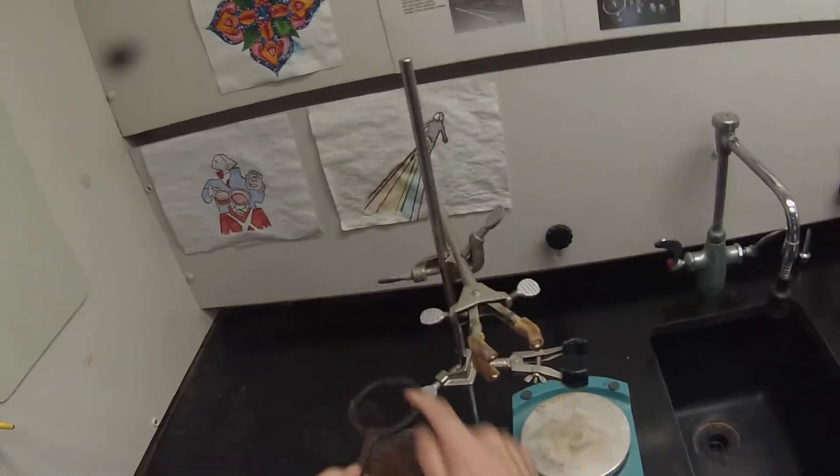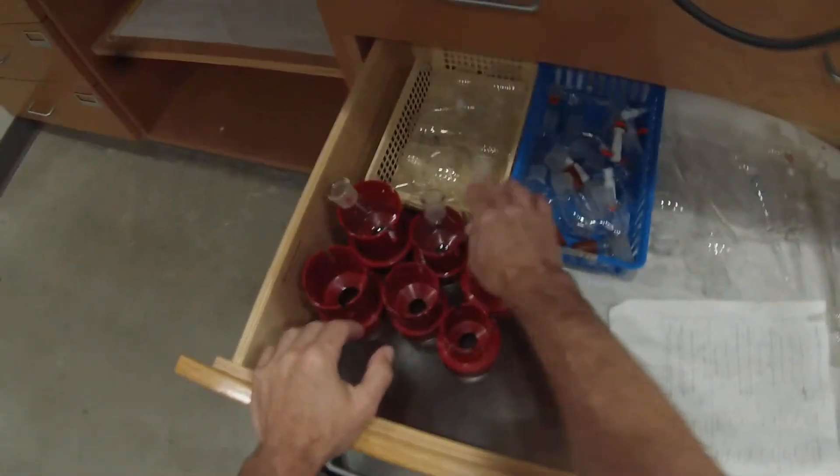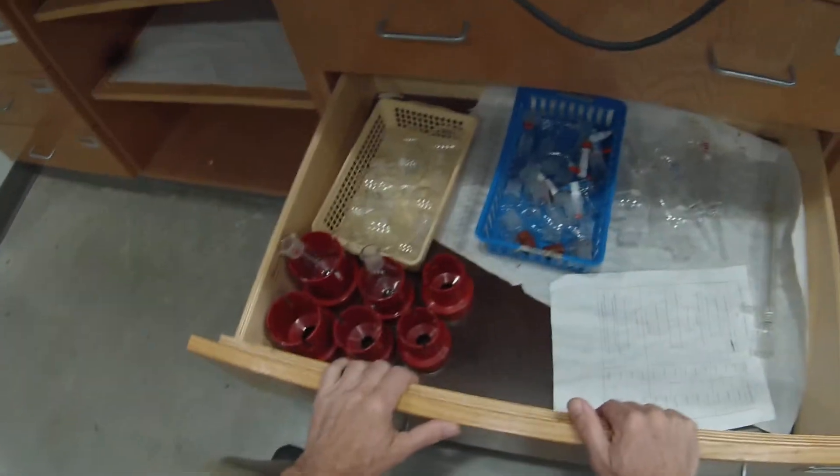The iron ring is going to be used to hold a funnel when we do our filtration, so I'm just setting that aside for now. What I need now is a 50 milliliter round bottom flask. Drawer C, which is the middle left, is the drawer that has all the glassware of the size we're going to be using right now.